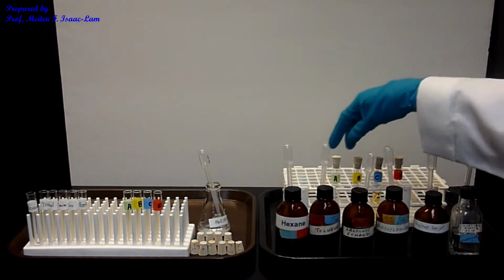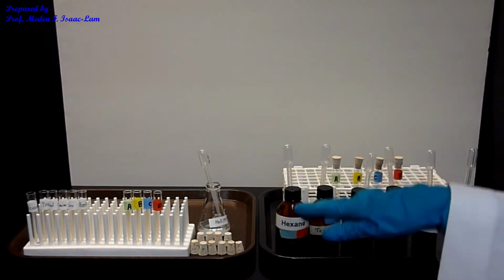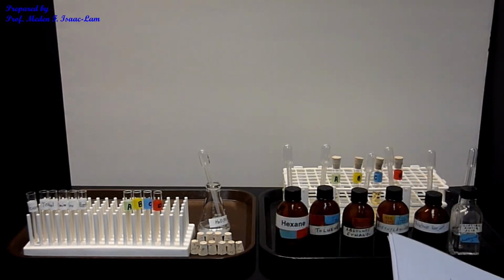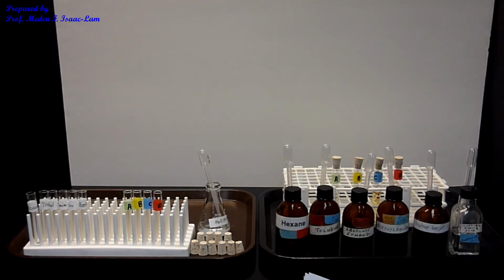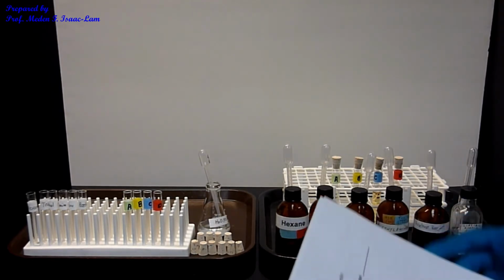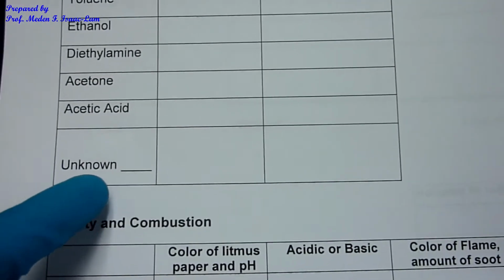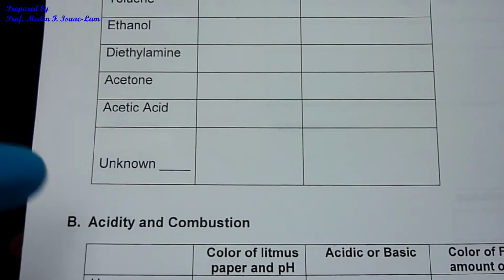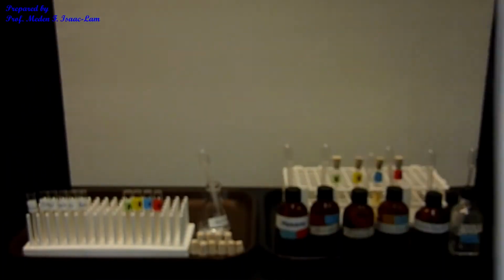I already put unknown A, B, C, D. It's going to be one of these. You're going to be assigned one unknown, so you're only responsible for recording that unknown. If you're assigned A, you record A, B, C, or D. Only one unknown for each student.